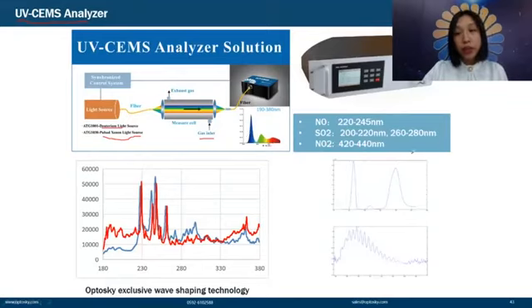And the spectrum readout is this one, just like this one. By calculating the absorbance, we can know the concentration of this part.